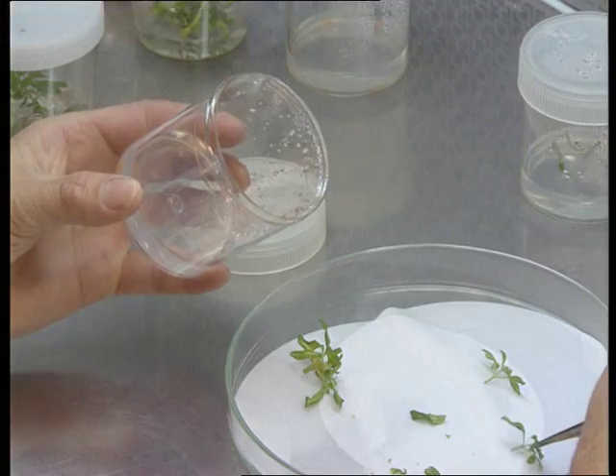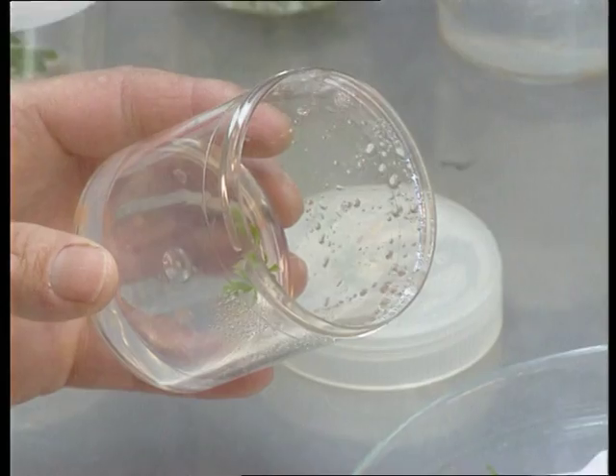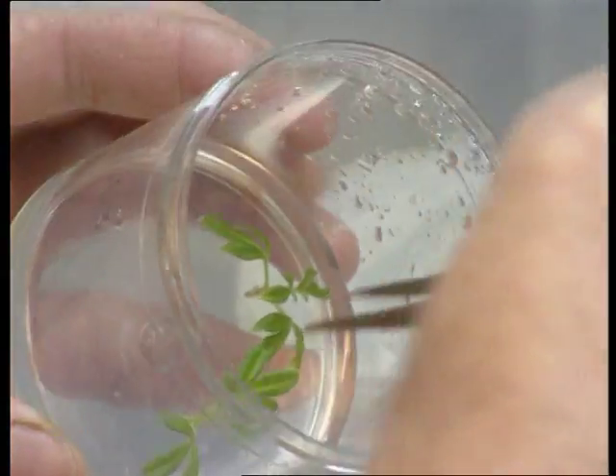Antibiotics are sometimes used in the medium to improve control of bacterial growth; however, the prolonged use of antibiotics should be avoided. Plant Preservative Mixture, or PPM, is a new product which reduces infestation rate dramatically when added to culture medium. Clean cultures from this stage are then transferred onto the next stage, which is the multiplication stage. This stage usually takes about four weeks.